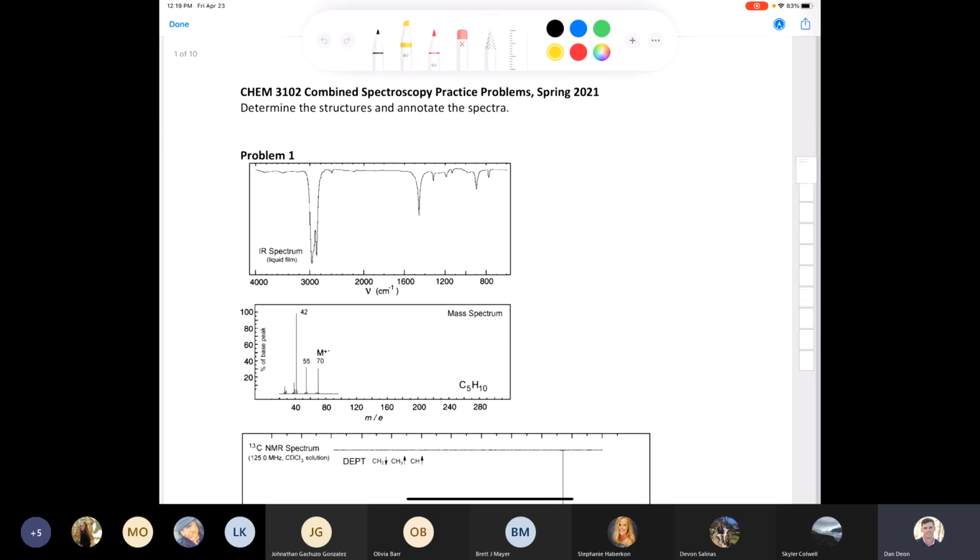But I do want to turn your attention to the tables in our textbook, the Schatzl book. In your lab textbook, you have the IR table on page 116, and you'll find that this table is a little more exhaustive than the table in the Klein textbook. It's table 2M-1.